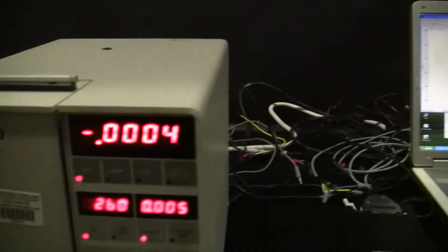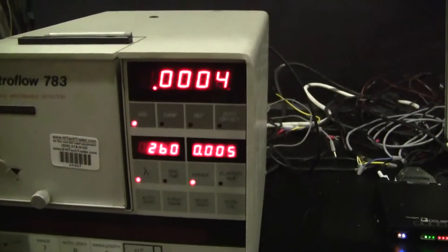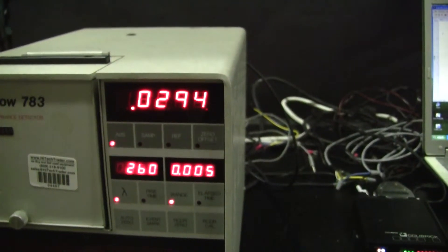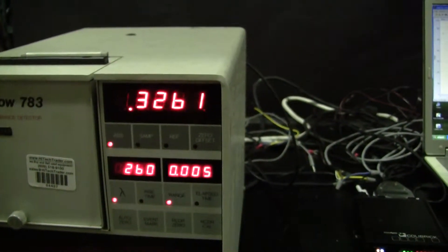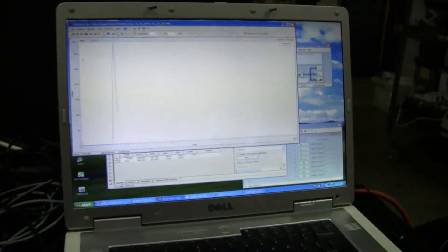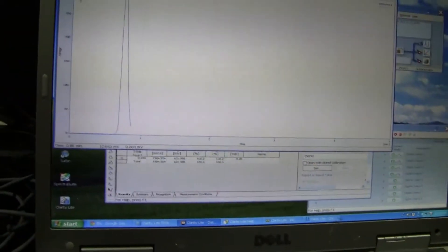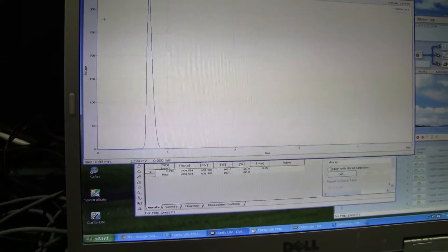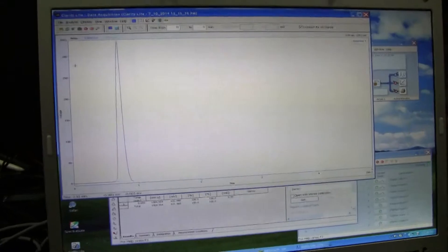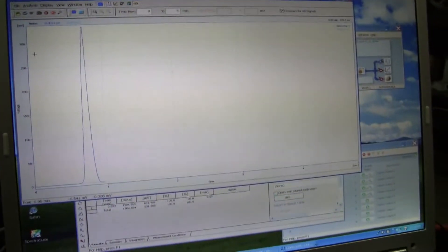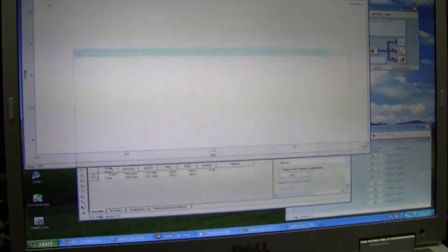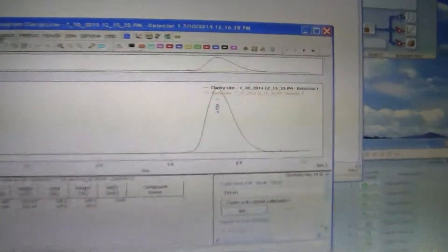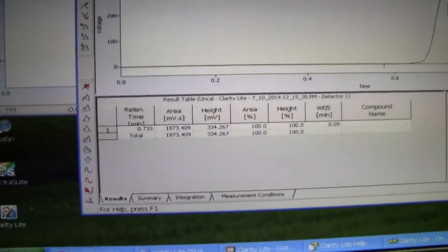In just a moment we're going to see some hopefully significant peaks. There we go. From this we can take a look at the chromatography curve, area and peak.